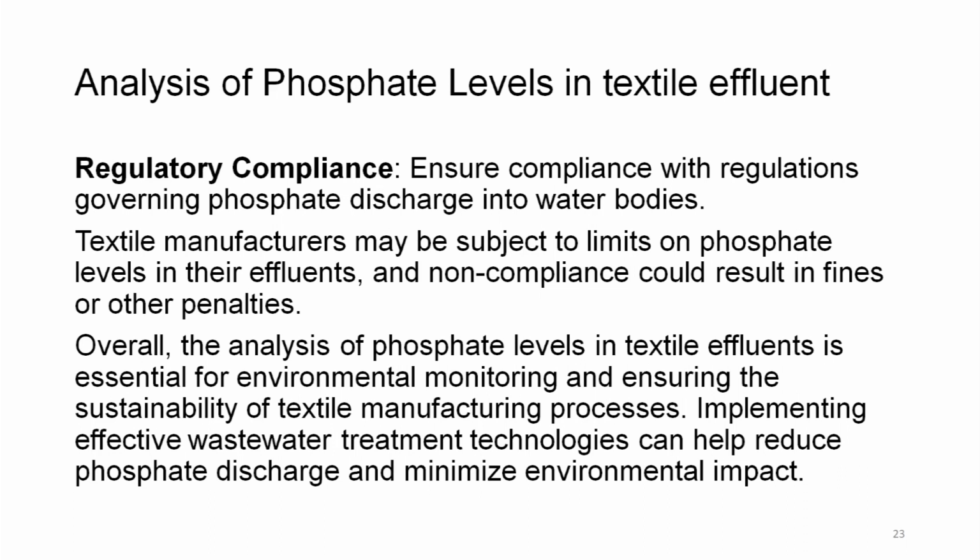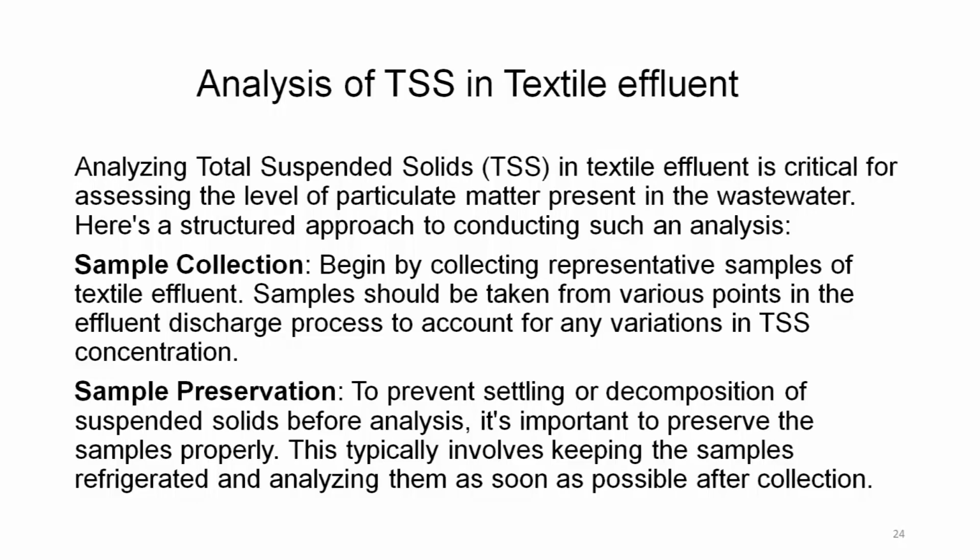So, by doing so, we can actually find mitigation methods and can effectively have wastewater technologies planned out in that manner, and therefore, it will minimize the environmental impact eventually. Now, let us see how total suspended solids are analyzed.